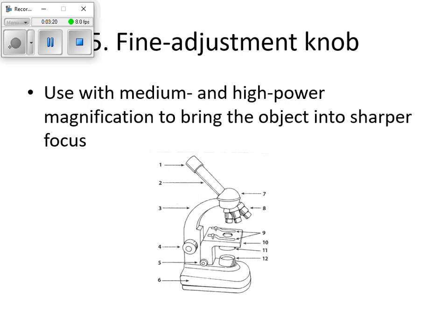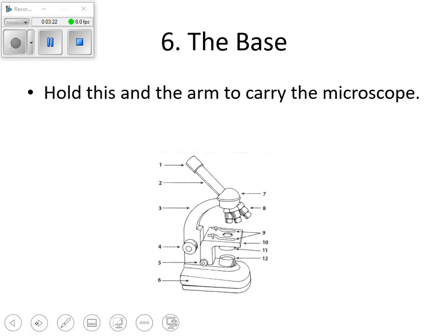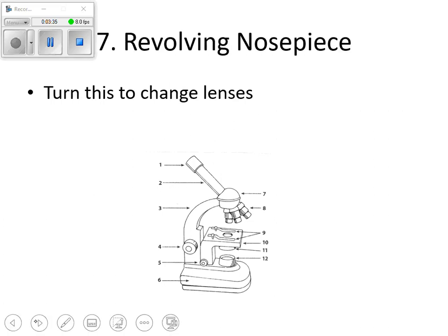Let's keep moving here. 6 is the base. Hold this and the arm to carry the microscope. So we're going to use 3 and 6, the arm and the base, to carry the microscope. Okay. Revolving nose piece. So basically, this just turns it around.